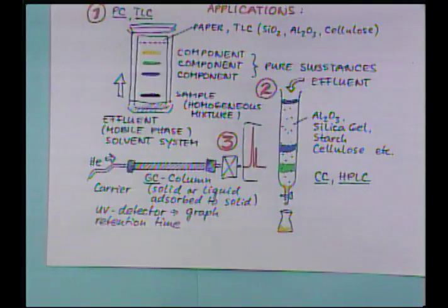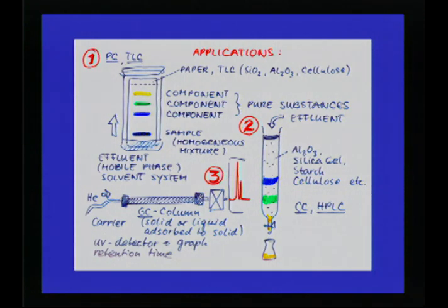Here I have a crude little sketch of a gas chromatographic column which uses not a liquid driving force but a gas, which is helium. But the column also contains a solid through which the components are driven by the gas, and they come out at different times depending on the retention factor, and we have a nice array of spectral peaks that can be correlated to whatever component we are interested in analyzing.